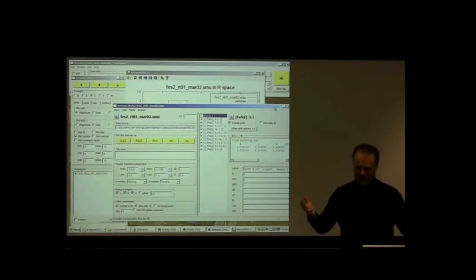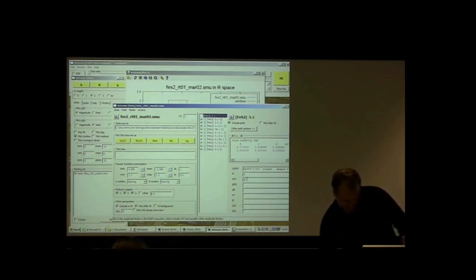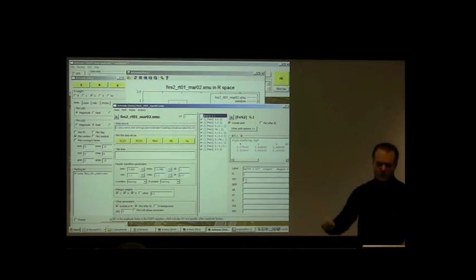So I am going to define a word to represent the S0 squared parameter, and I'm just going to call it amp for amplitude.